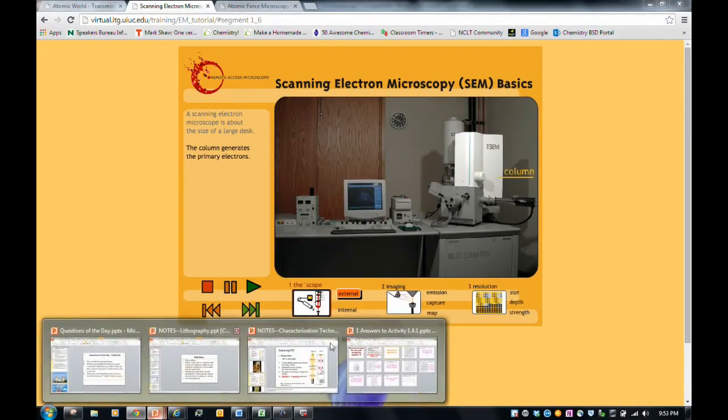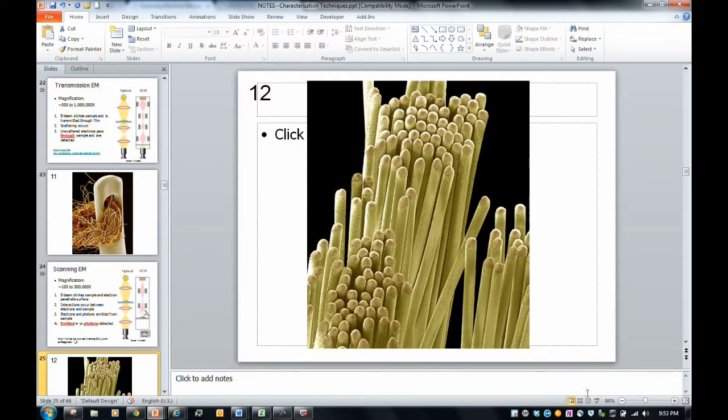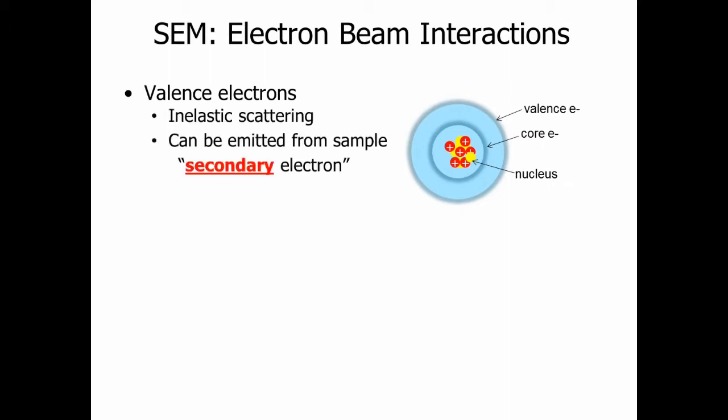All right, so you've got the SEM basics down. Let's talk a little bit more about the electron beam interactions with individual atoms.